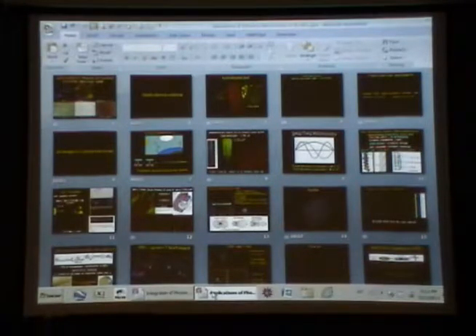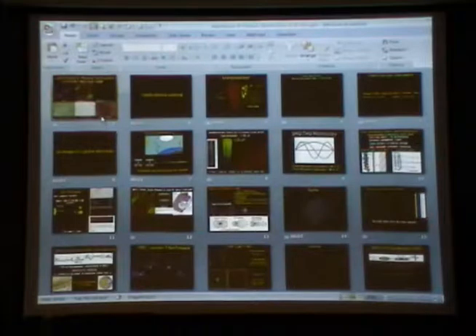I promised the biologists that I would buy all the commercial systems. So this is the one that they have. This is a company called JPK from Berlin in Germany. They have another one in Israel. They claim that their tip is not like this, it's like this, so you can even see the transmitted light. So you don't lose the transmitted light. So let's see a little bit of the example, otherwise it's going to be too much talk.